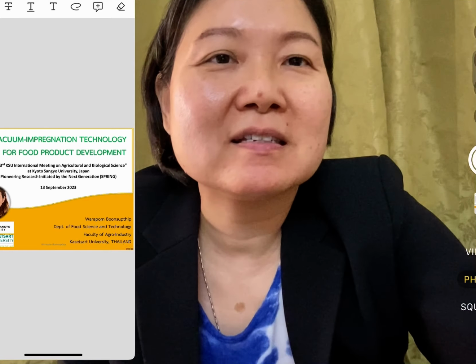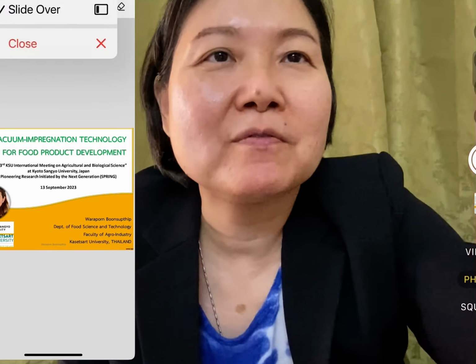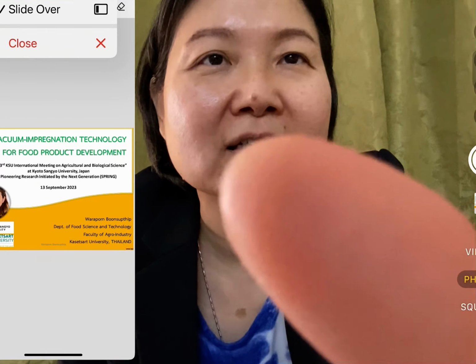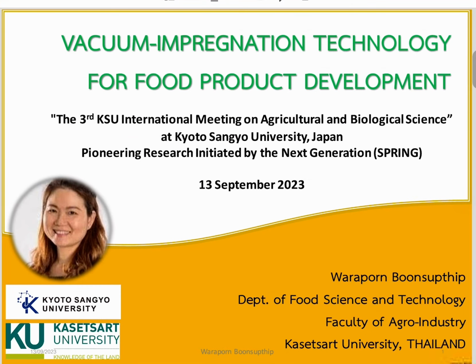My topic of research that I would like to share with you today is vacuum impregnation technology for food product development. In my lab, we've been using this vacuum impregnation, in short, we call it VI. This technology, we use it to develop new products and also new processes. I would like to share with you some of our laboratory results.